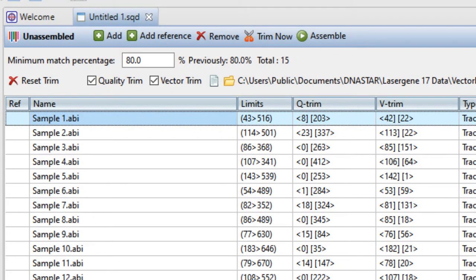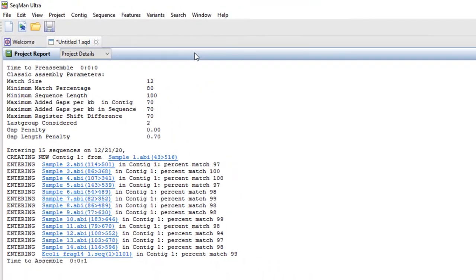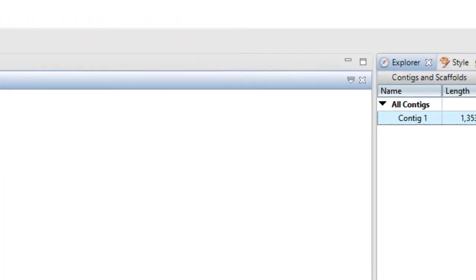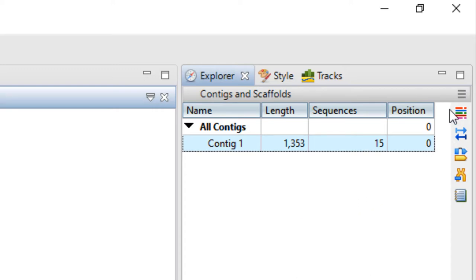To start the assembly, press the Assemble button. After assembly is complete, contigs are shown in the Explorer panel. Select a contig and open the alignment view by pressing the uppermost tool icon.